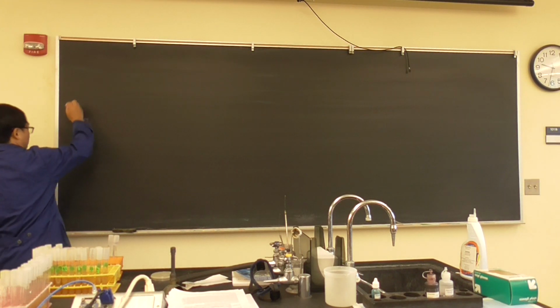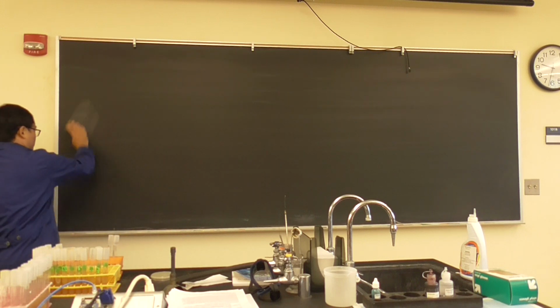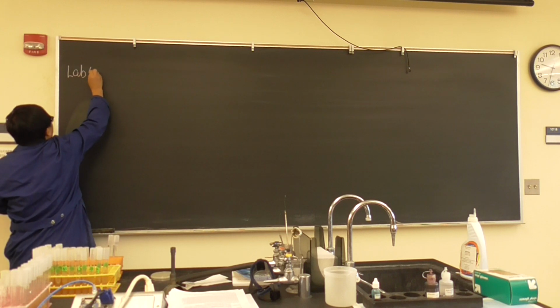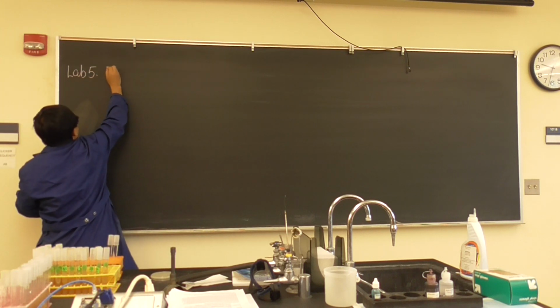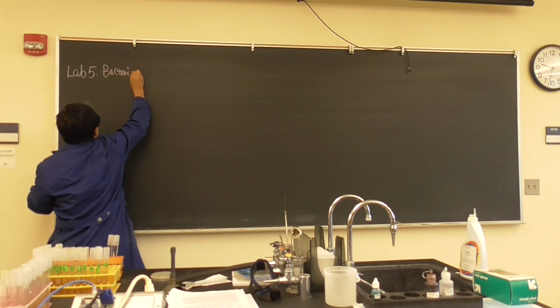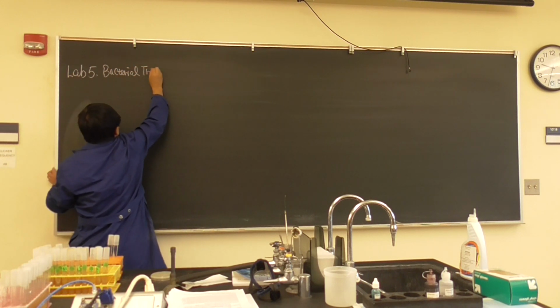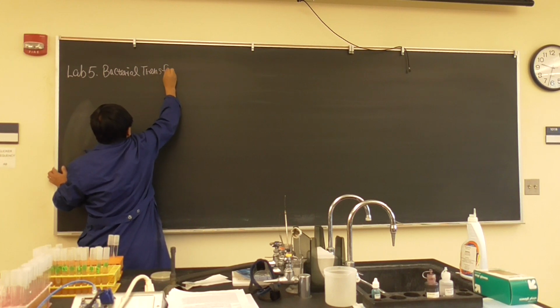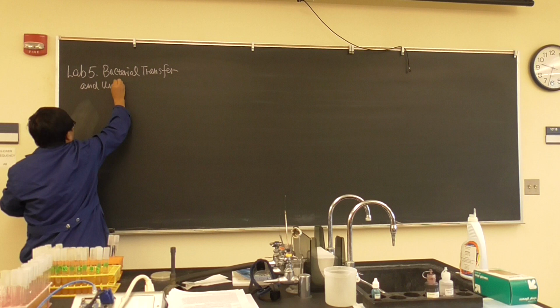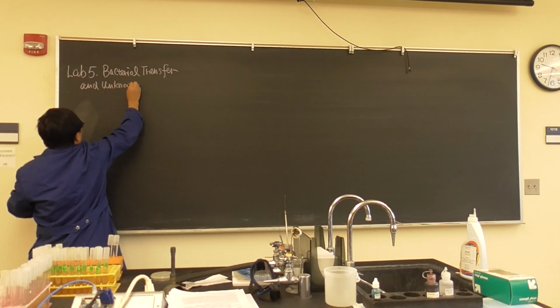So we're going to have lab 5. We'll say bacterial transfer, and unknown number one.